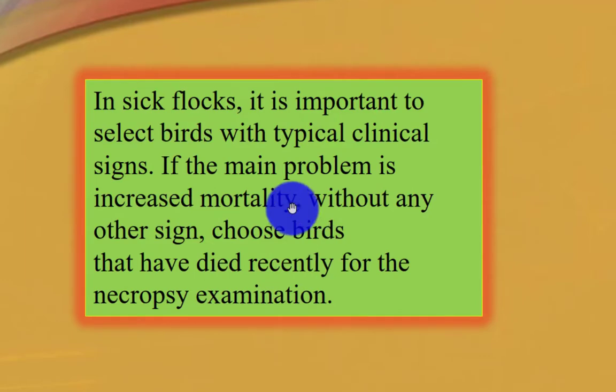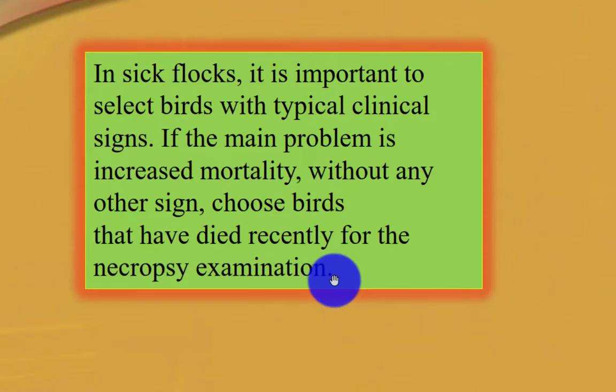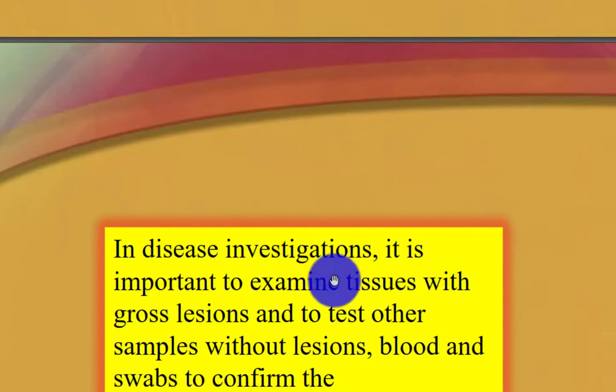In sick flocks, it's important to select birds with typical clinical signs. If the main problem is increased mortality without any other signs, choose birds that have died recently for the necropsy examination.